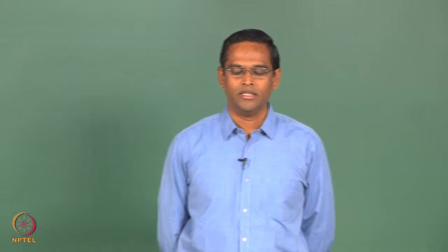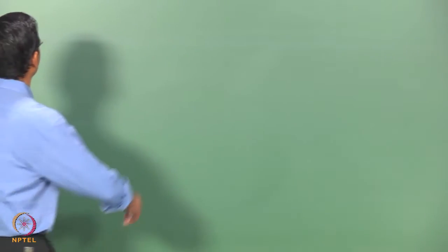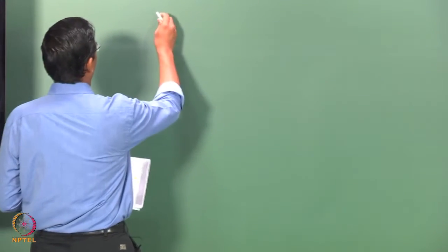But if you want to appreciate the effective application of optical microscopy, I think you need to understand the basic idea of quantitative microscopy. I will just introduce the basic concepts, not getting into details. So what I will do is demonstrate the basic idea behind this.